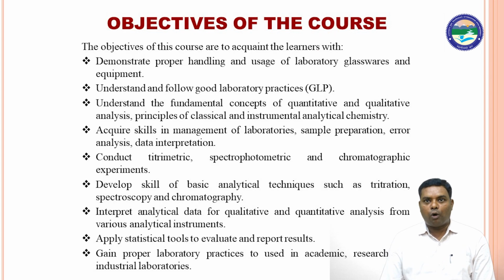The objective of the course is to prepare for handling and use of laboratory glassware and equipment, understanding and following good laboratory practices, understanding the fundamental concepts of quantitative and qualitative analysis, principles of classical and instrumental analytical techniques, and acquiring skills in laboratory management, sample preparation, error analysis, and data interpretation. Conduct titration, spectroscopic, and chromatographic experiments to develop the skills of basic analytical techniques such as titration, spectroscopy, and chromatography.